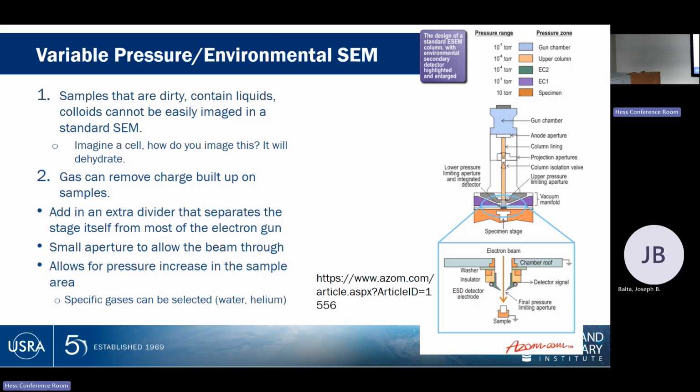The difference with a section of a rock is that once you get the bug coated, you can't ever get the coat off. I mean, I suppose if you dropped it in something, it would dissolve the bug as well as the carbon coat or whatever kind of coat you put on it. But it's very typical that we put thin carbon coats on polished thin sections of rocks, like silicate minerals, which are not conductive. And then we can take the coat off very easily if it gets a little bit dirty or if we need to look at it optically without the coat on it. You can take it off and then you can recoat it. So that's the difference between a 3D thing and a polished sample.